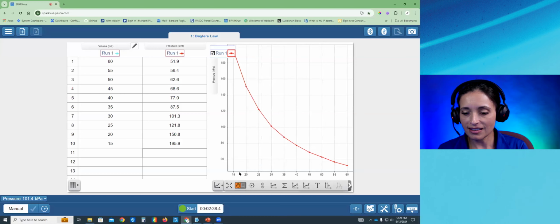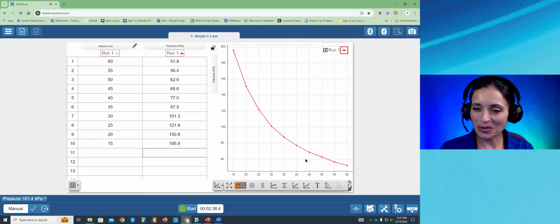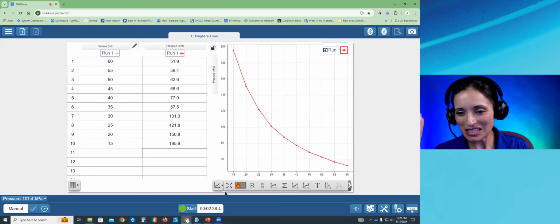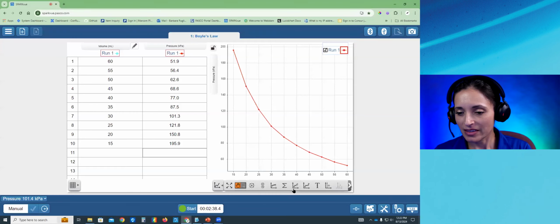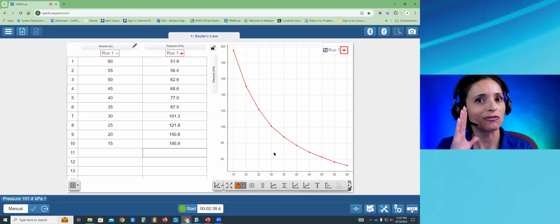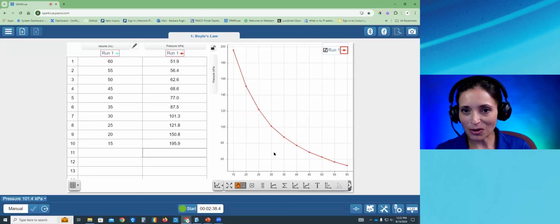And we see that, let me move that out of the way so you can see a little bit better. You can see that there's definitely a trend. There's a pattern here, and students might right away recognize that. Oh, that's not linear. Well, it's not a straight line anyway. It's a curve. So I'm probably not going to need a line of best fit straight line, but I can probably fit some kind of curve. So using the graph tools here, you can stop the lab here, and students can recognize, oh, when I have this shape, it's an inverse fit, right? As one goes up, the other goes down. You can stop the lab there and leave it at that, or you can take it all the way as it's written to mathematical modeling.